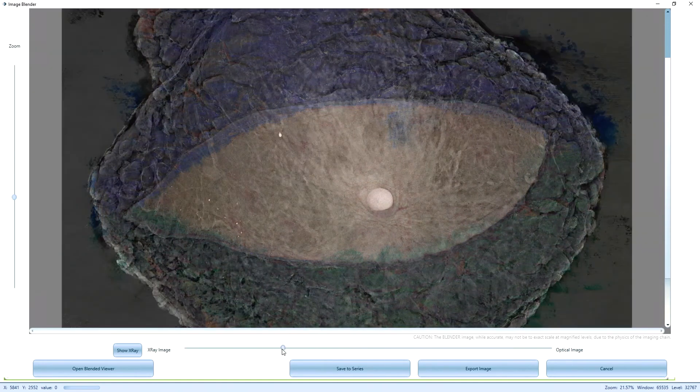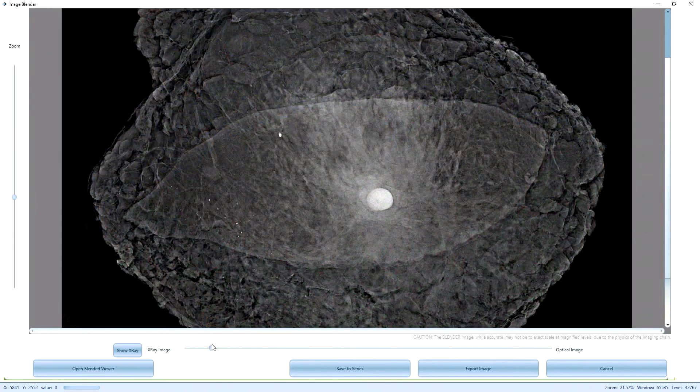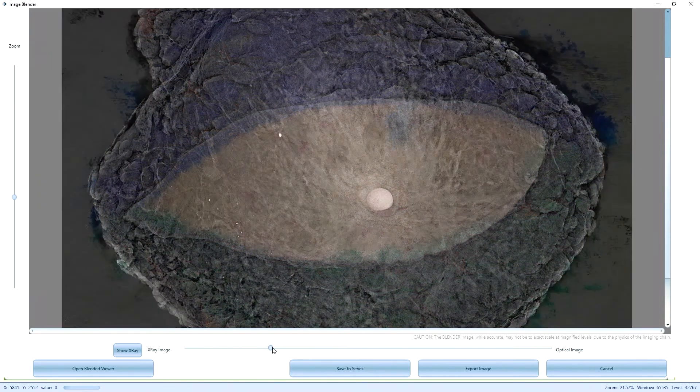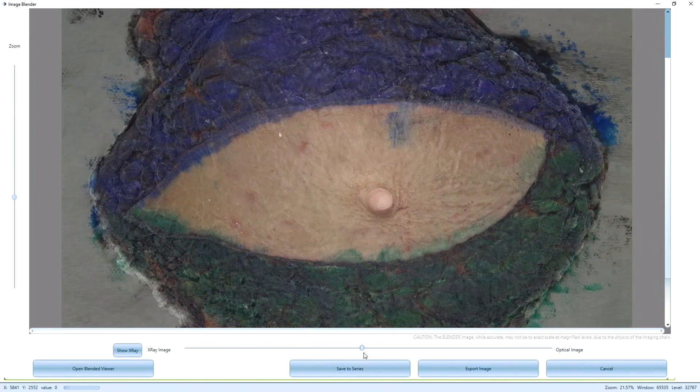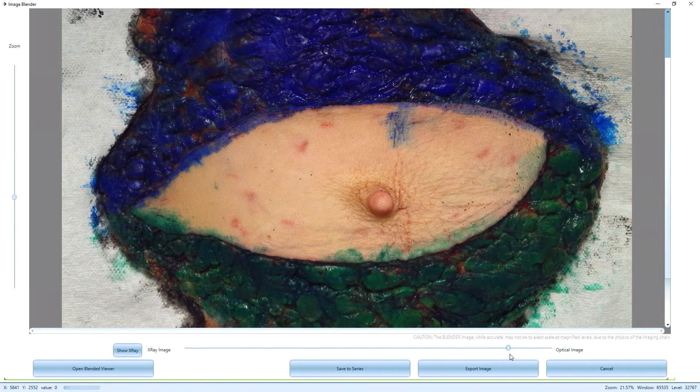I can use the Blender to change the view from all optical to all x-ray, or anything in between.